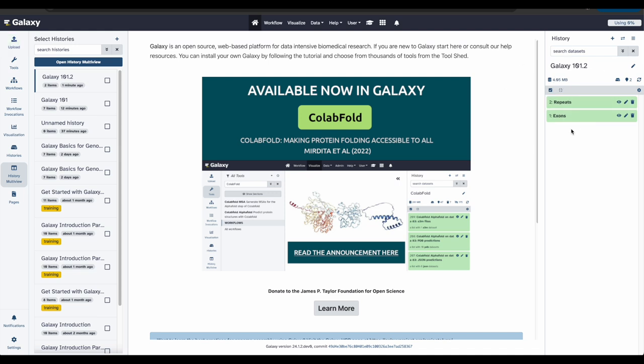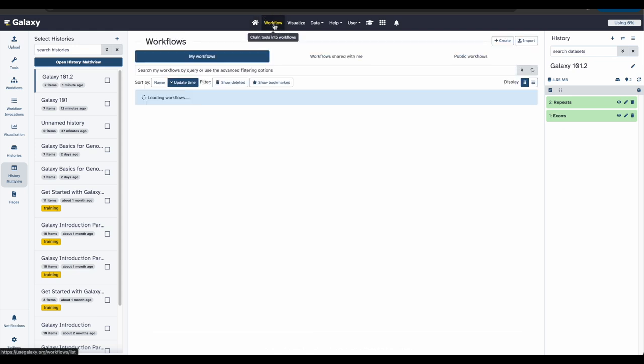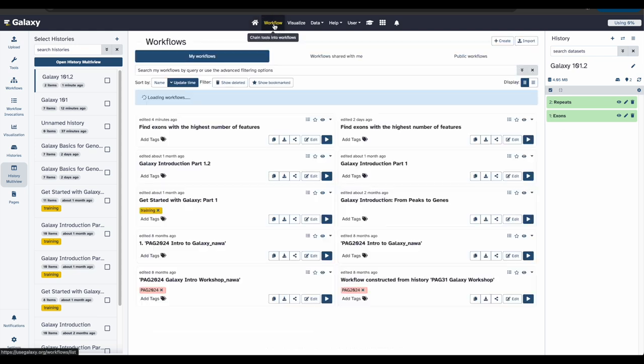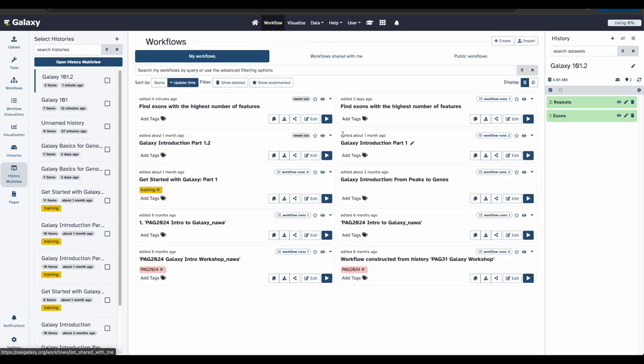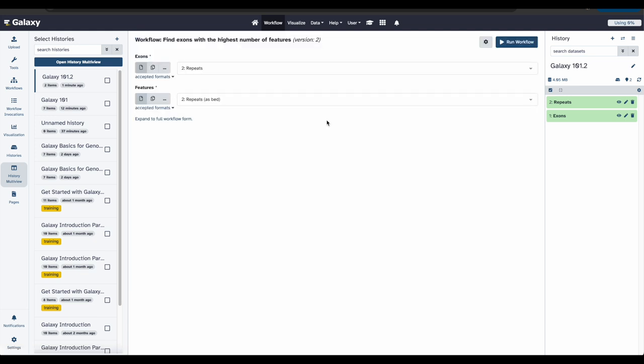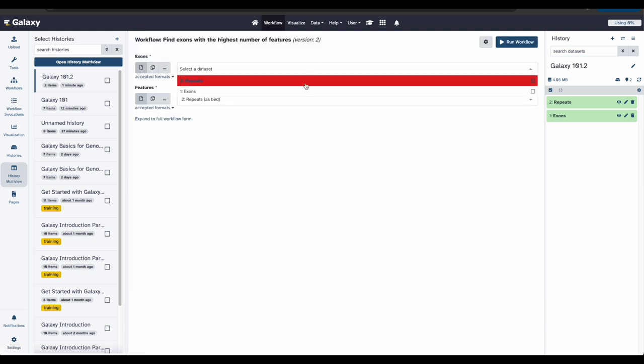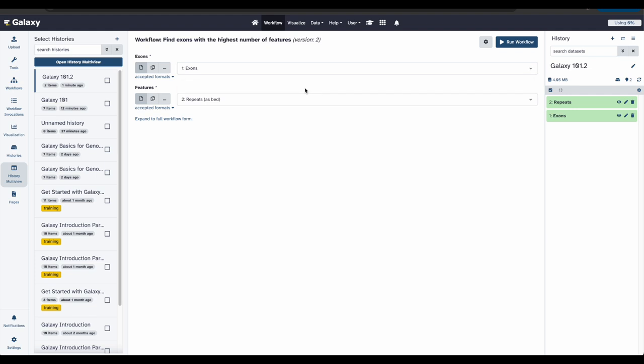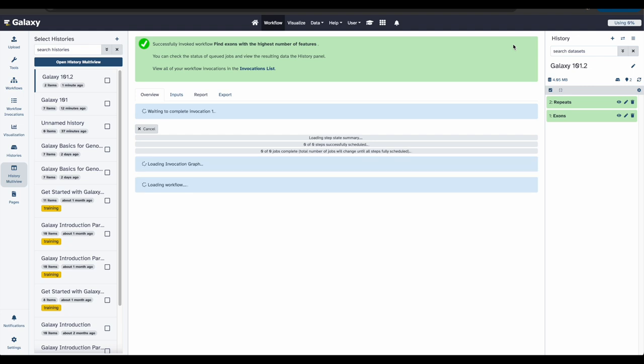Now that we have our two data files, we want to rerun our workflow. To do this, we will go back to our workflow and we will click Run Workflow. We want to fill in the inputs. We want exons to be the first file and repeats to be the second. Now we will click Run Workflow.